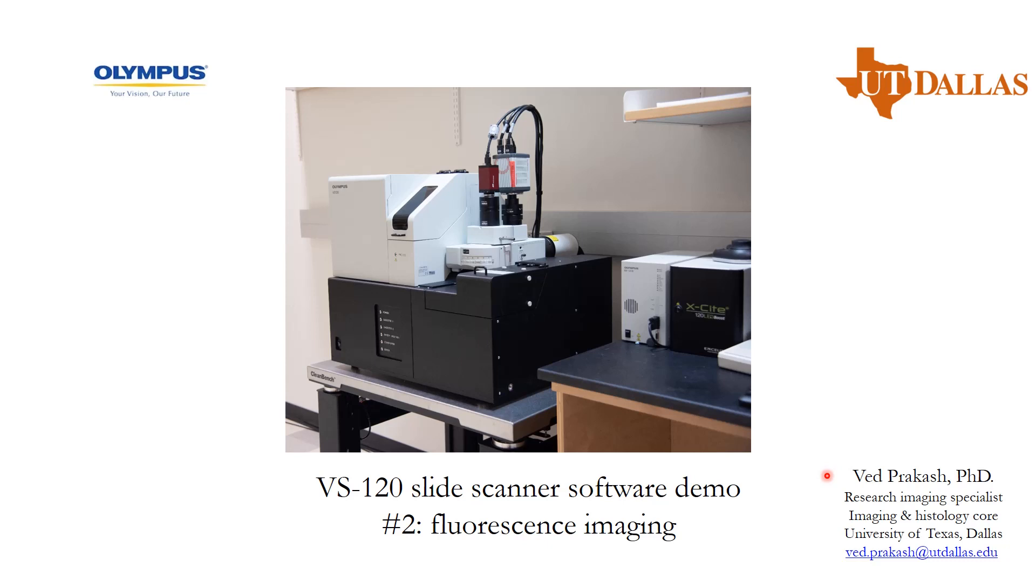Hello, welcome to module number 2 of virtual slide scanner software demo. In this module, we will be covering the fluorescence imaging aspect of this microscope.